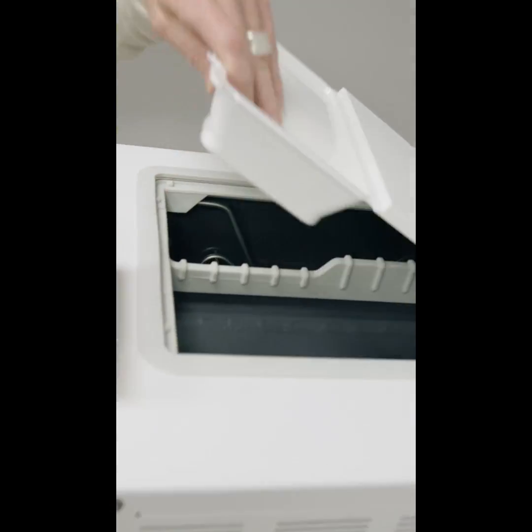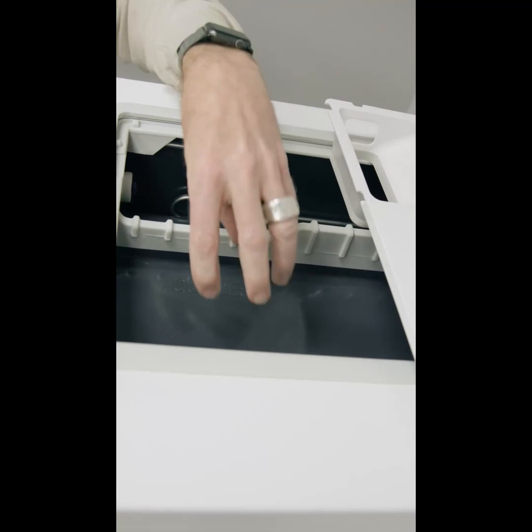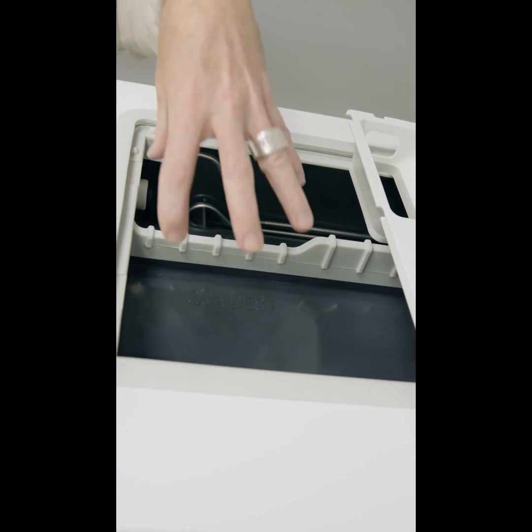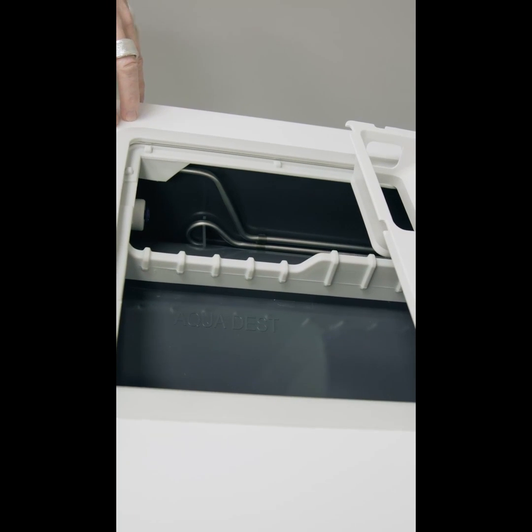In the chamber, you'll notice with this unit we've got two tanks. We have a clean water tank and we have a waste water tank, and it's important that both those tanks are emptied of water.